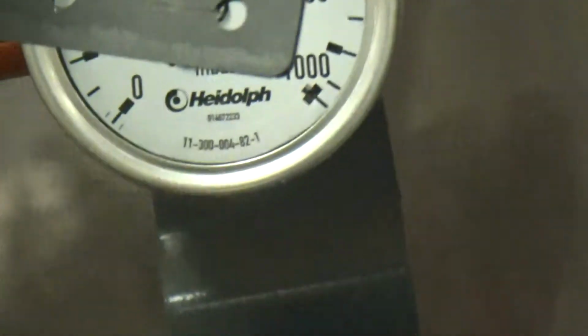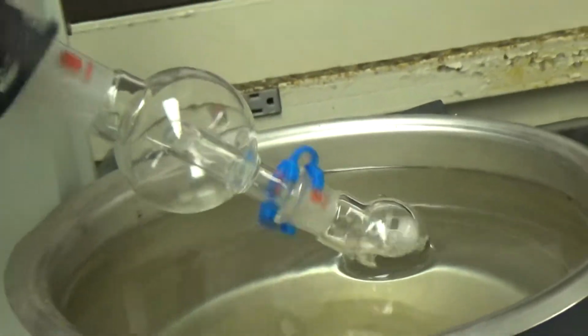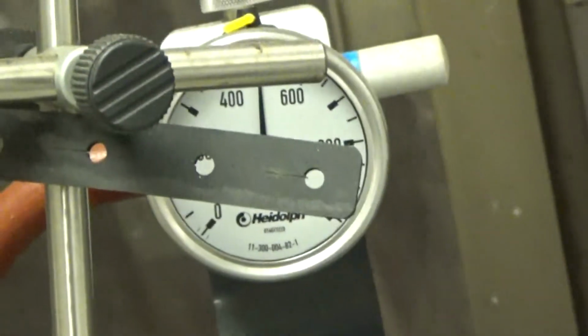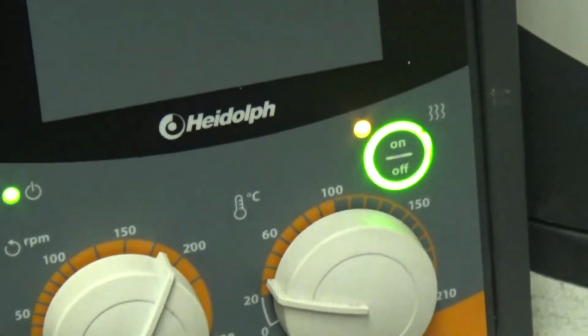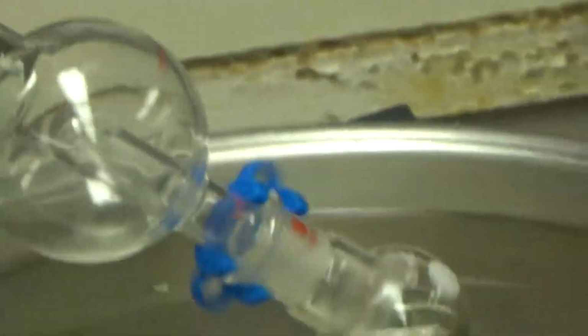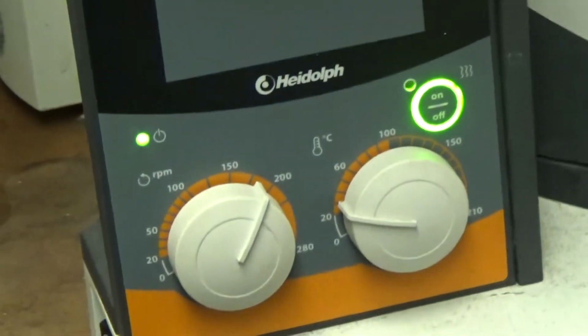You don't need to use heating here because that's methylene chloride, and methylene chloride has a low boiling point. The boiling point of methylene chloride is 40 degrees Celsius. You don't need to add a warm temperature because if you do, it might bump into the bump trap. I turned the water bath on here, but I just kept it at 30 degrees, a relatively low temperature.